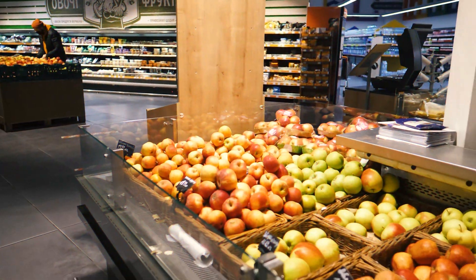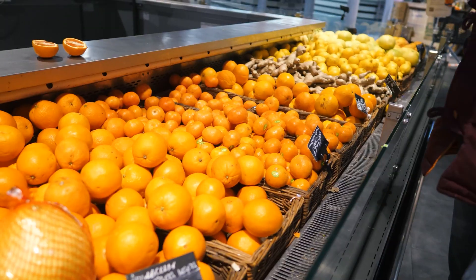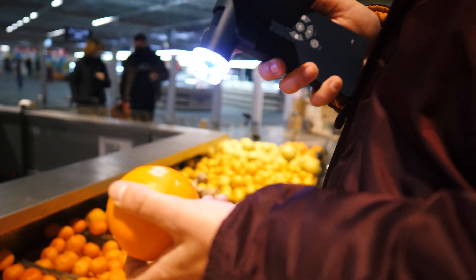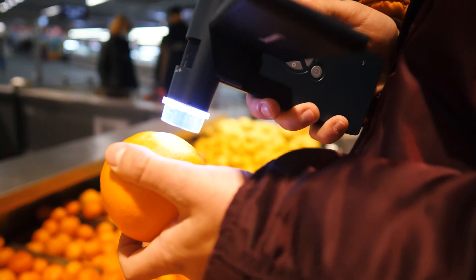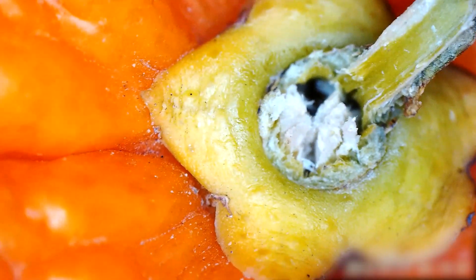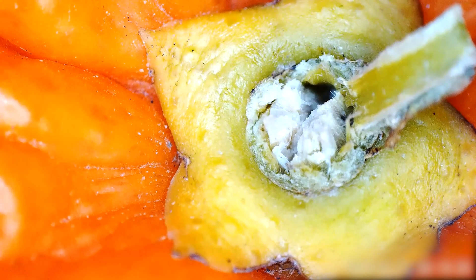Even with such a microscope, it is convenient to go to the supermarket, where you can easily check any fruit or vegetable for mold or other microorganisms. If you consider an orange under magnification, then the orange peel will look like this. This glare can be removed by using a special polarizing filter, which is already pre-installed in this microscope. Here is just clearly visible micro-mold — I didn't even notice it with the naked eye.